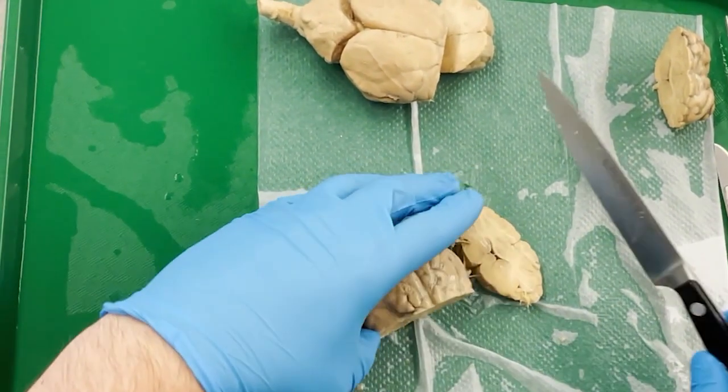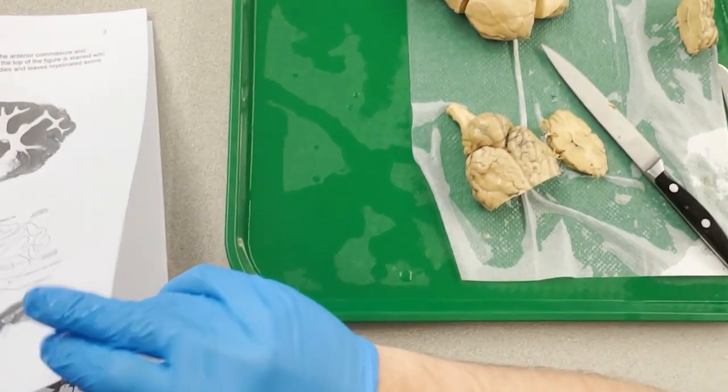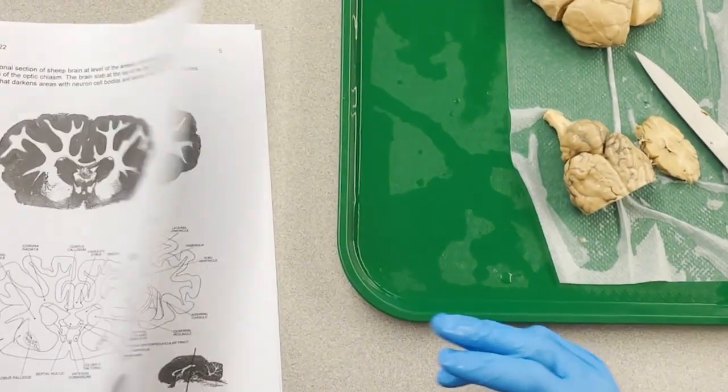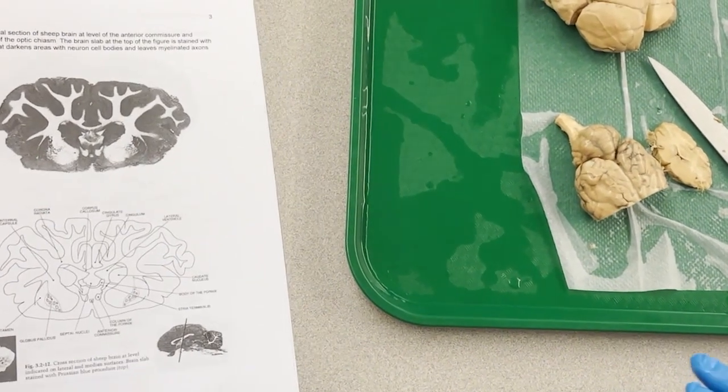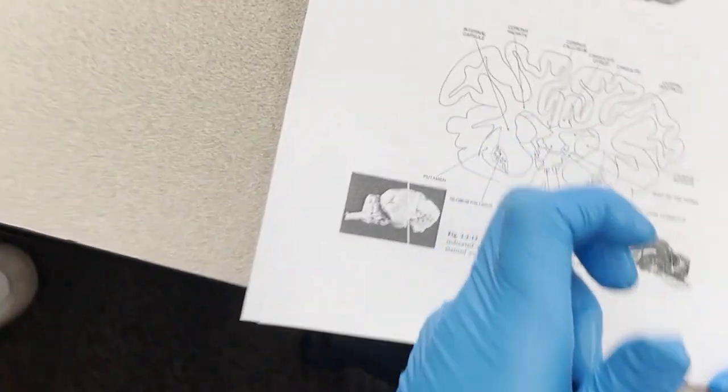Okay, so then we got another cut here, and I'm just going to make sure that it's not too far. Yep, this is where I want to be. There is, on this page, a line going here. You can bring down the camera to here.